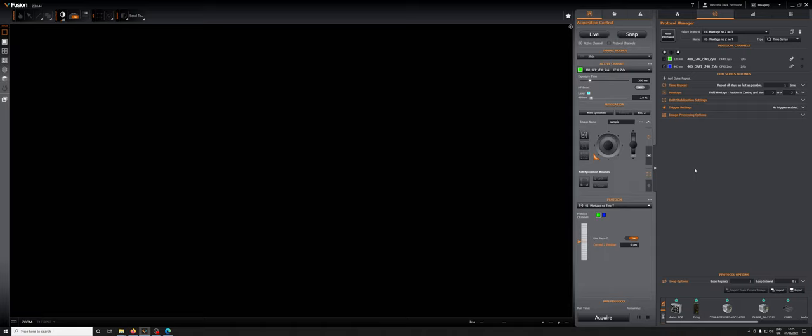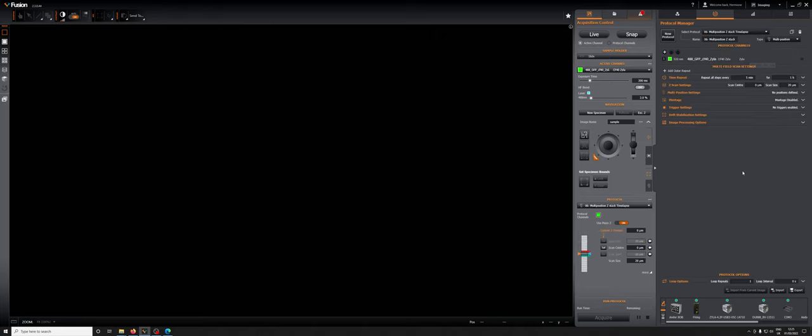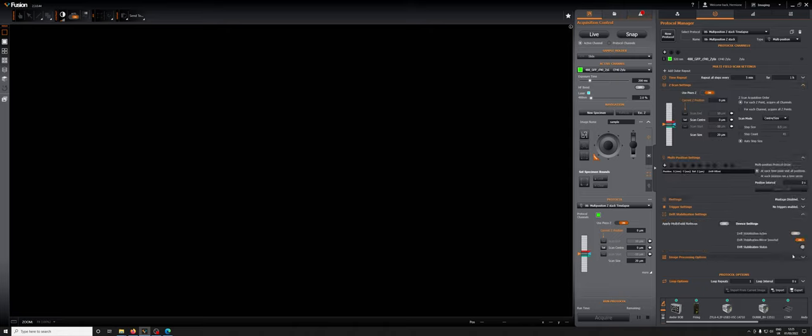To do this, we're going to select one of the multi-position protocols. I'm going to select for the purposes of this training a multi-position z-stack time-lapse protocol. That's going to load up and we are going to focus on the z-scan settings, the multi-position settings, and the drift stabilization settings.